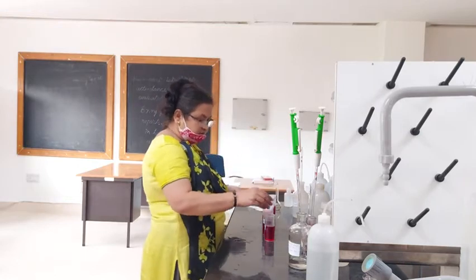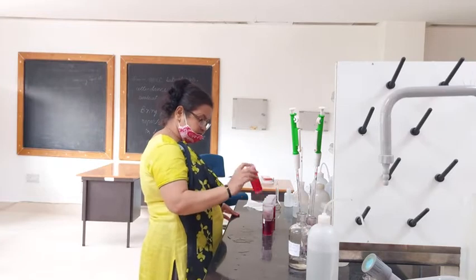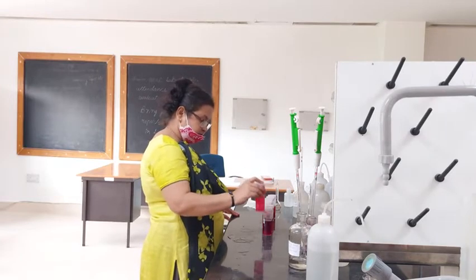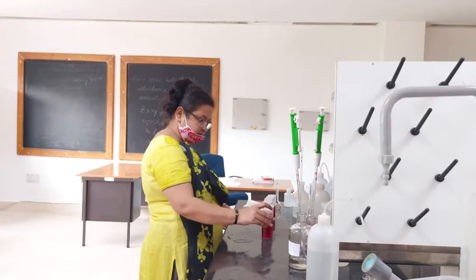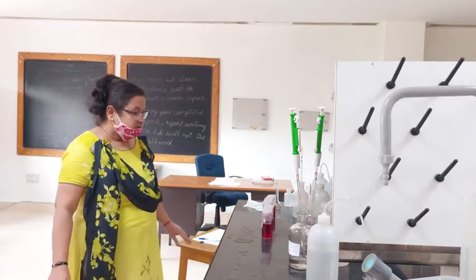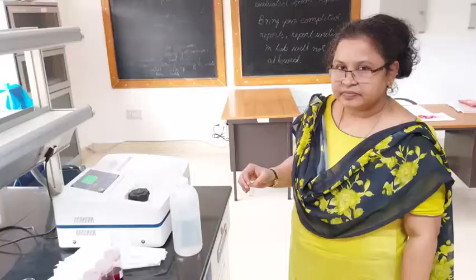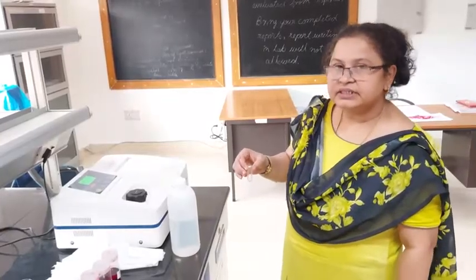Now we will allow 10 minutes time for color development. Time we are allowing for color development. Okay, now 10 minutes time is over.